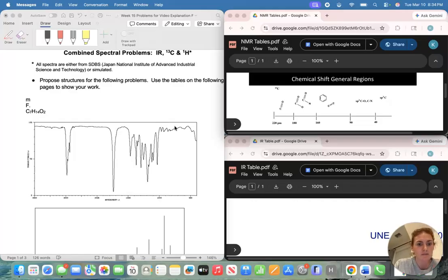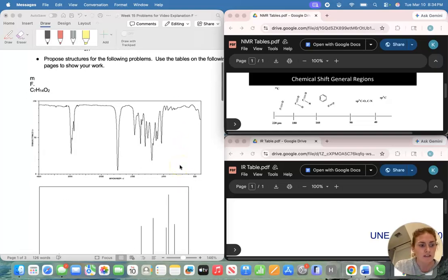Next, we're going to look at the IR spectra. So when we're looking at this, we're going to see that we have peaks around 1,000 to 1,200, but multiple here. Those are going to be consistent with your carbon bonded to an oxygen within a single bond. And then at 1740, this is a classic carbon double bonded to an oxygen. And then here we have a 2850 and 2980. We see peaks that indicate a sp3 hybridized carbon hydrogen stretch.